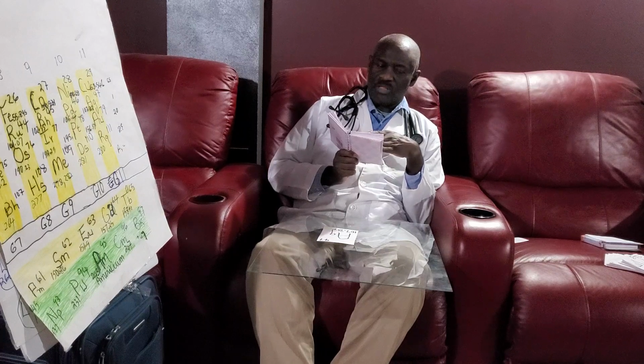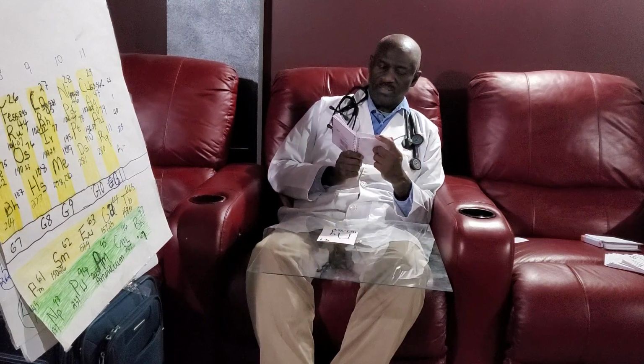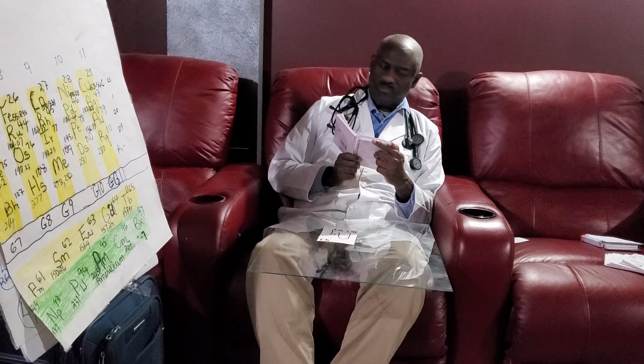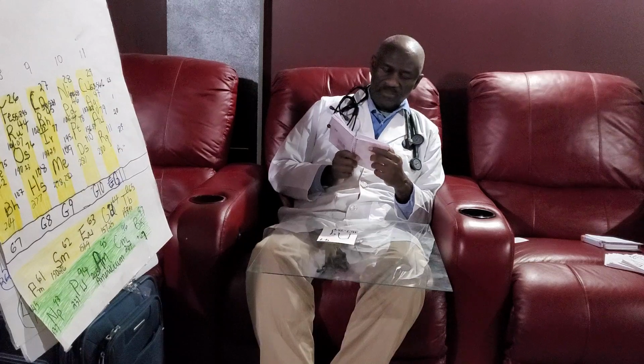And instead of getting hydrogen, you get water combined with the hydrogen to give you water. So you get some form of silver oxide here, Ag2O, which is a solid, and water. And I guess the sodium would have to be some form of sodium ions. I don't think it will be independent, but we'll see.